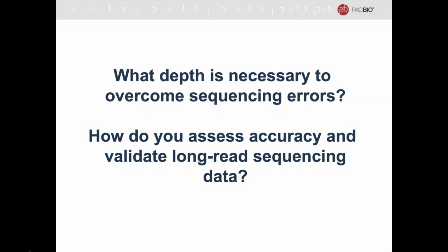Based on the completeness of the assembly output, we think that it actually does a better job than I had originally hoped for. So that's really good to see. But with these HiFi reads, the data we've seen from you guys, where we align it back to our reference and see over 99% identity, that's beautiful, because it takes out that initial step where it is a bit of a black box, where you're not exactly sure what's happening in the error correction stage involving separate but very similar subgenomic sequences.